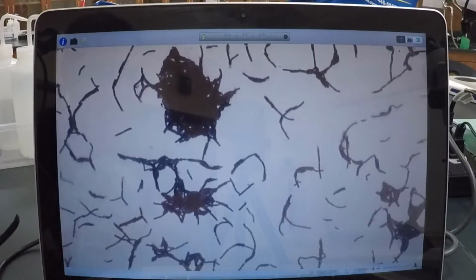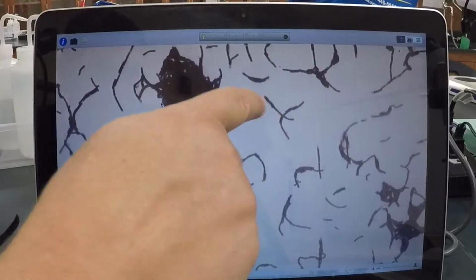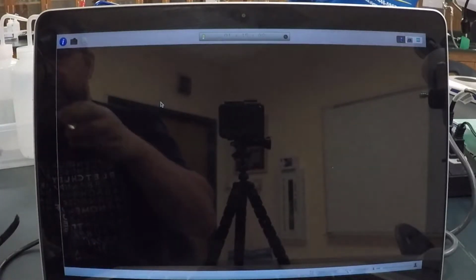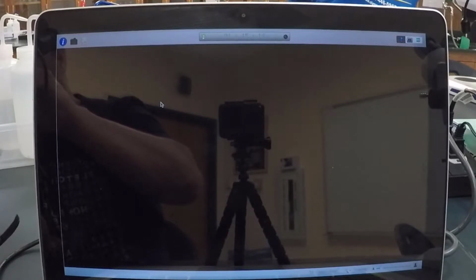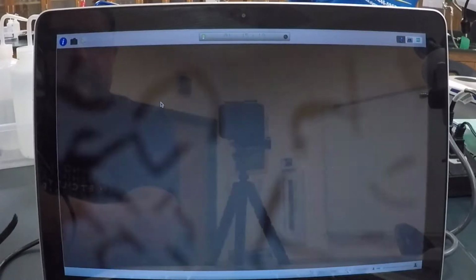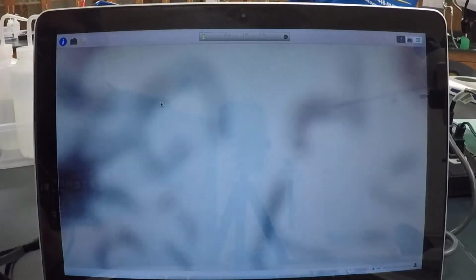So here, even at 400 times your eyesight, you can just barely begin to see that these are rods. Okay, so I'm going to jump over to oil, 1,000 times your eyesight, and we'll see what we get here. I'm going to turn the light up quite a bit and change the focus.